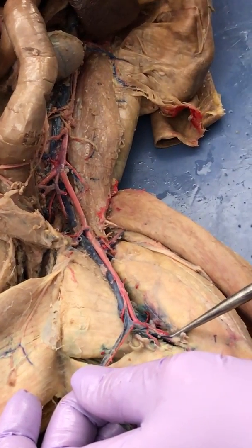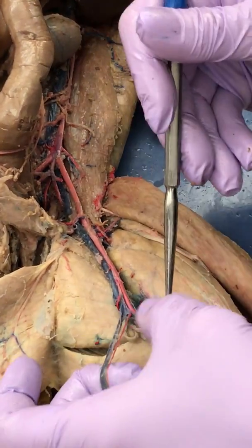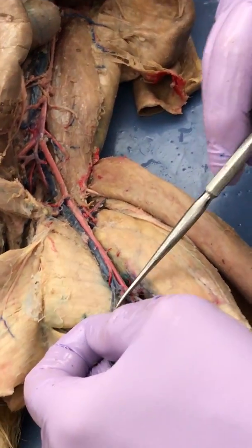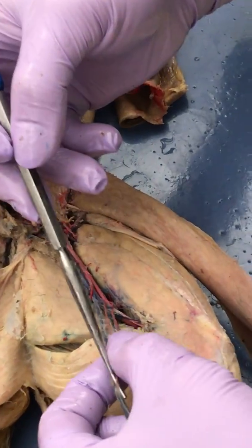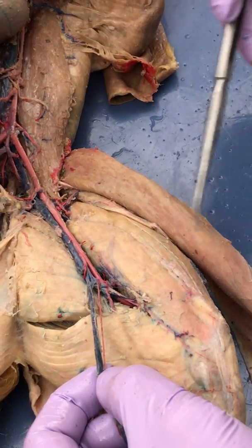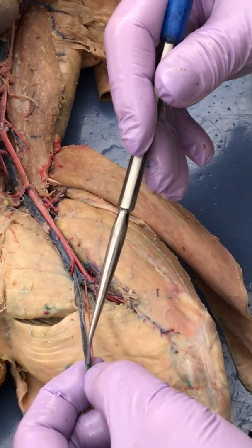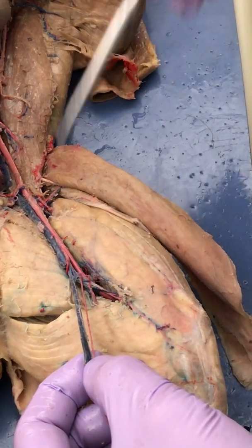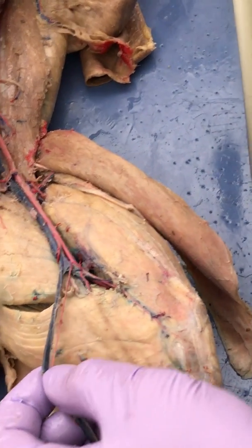What is that? Goes into the back of the knee. Popliteal. And then not so much stays out here, but what is that? Saphenous. And so, of course, we have artery and vein. So if I put the pin in the blue, write saphenous vein. If I put the pin in the pink, then write saphenous artery. Okay, let's flip your cat.